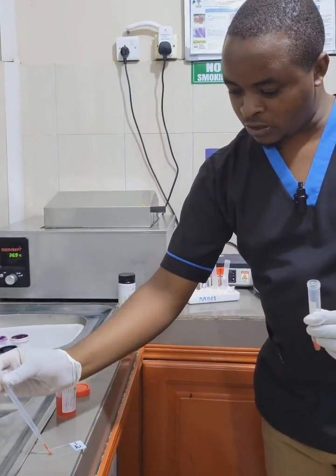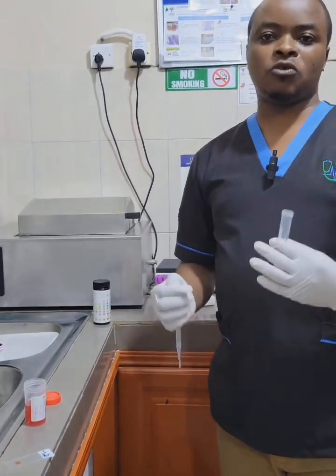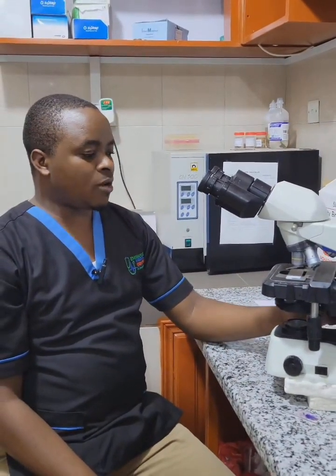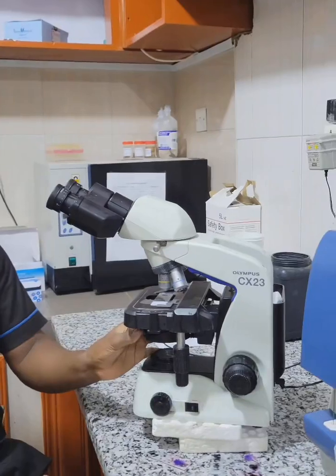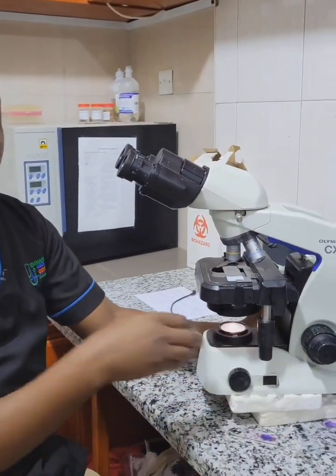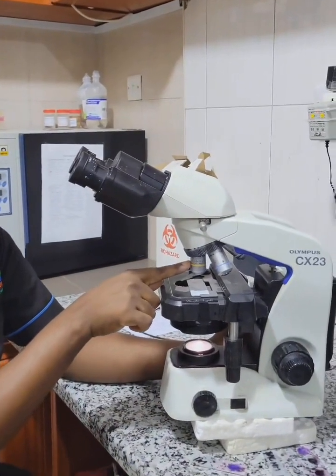Then after putting it on a microscope slide, you apply a cover slip and examine microscopically using ×10 and ×40 objective lens. To do this, you place the slide on the microscope stage, then you lower the condenser. After lowering the condenser, you close the diaphragm. Then you examine the urine using the ×10 objective.